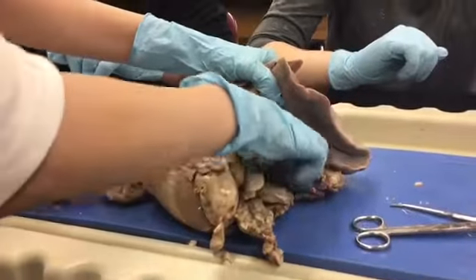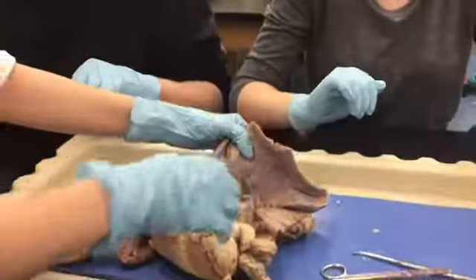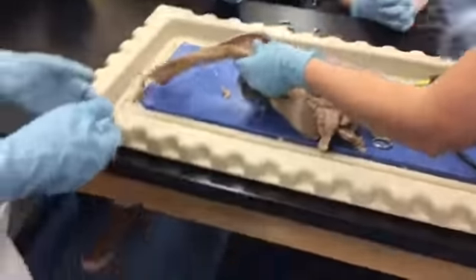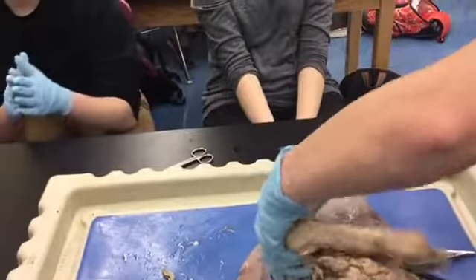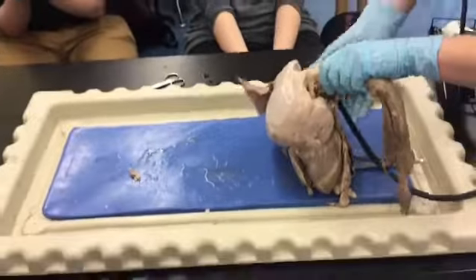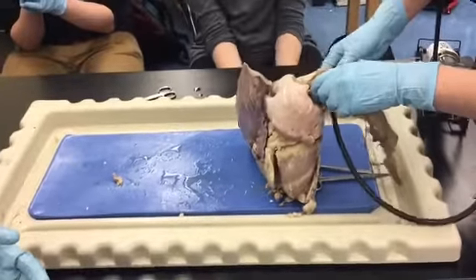I don't know what it all is, but maybe the diaphragm? Is this the diaphragm? Down there, yeah, probably. Yeah, that is the diaphragm. Cool. Can I inflate it? Sure. All right, guys, get a good look at this. So we are going to... Oh, dear. That's weird. That went a little crazy there. I overinflated it, so it had that air bubble.